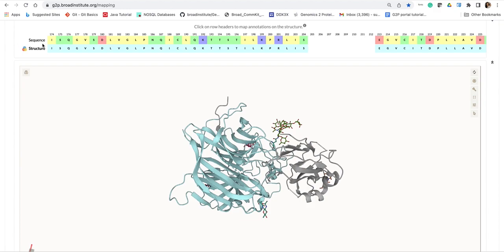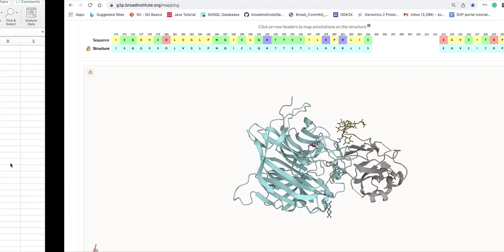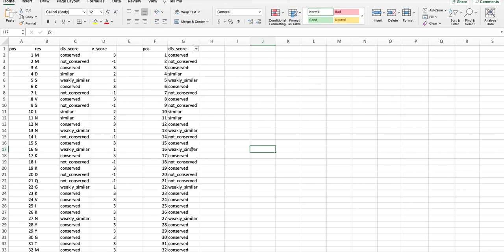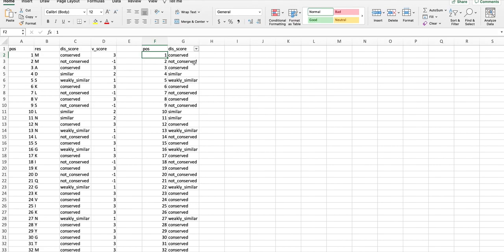Now the purpose of this tutorial is to map the conservation between Hendra and Nipah virus onto this structure of Hendra glycoprotein. Prior to this tutorial I generated the sequence alignment using the program MUSCLE and I also generated a residue-wise annotation of conservation, where each residue is annotated as conserved, not conserved, similar, or weakly similar.